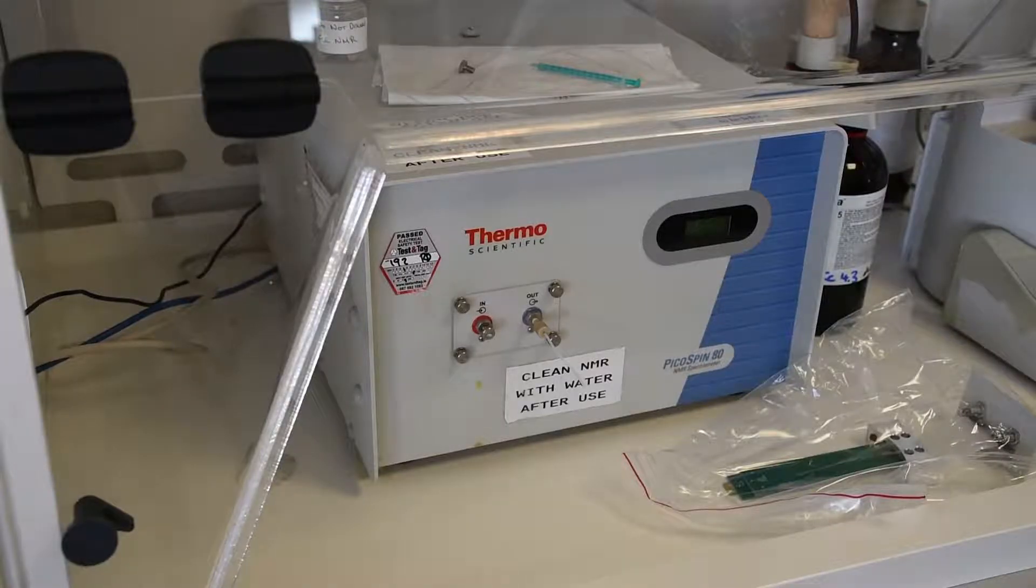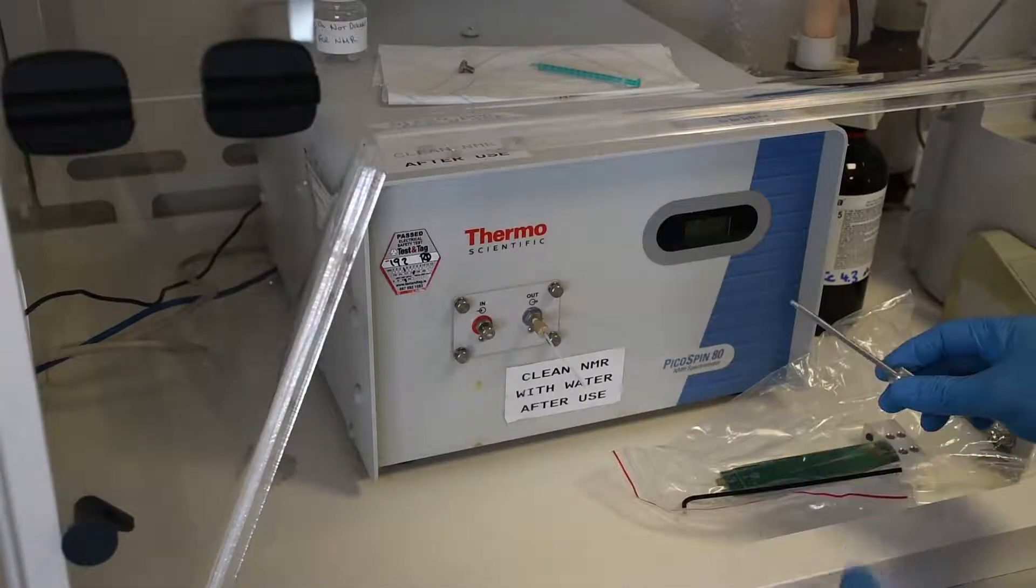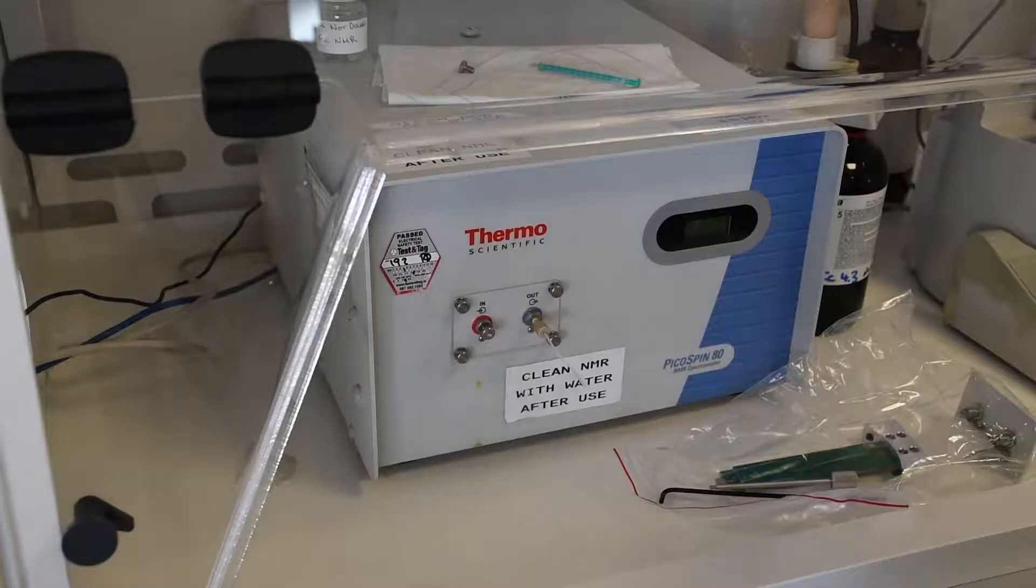It comes with a long allen key and a custom tool which is basically a screw that fits into a slot and allows you to pull the old cartridge back out. So here are those two tools, the custom tool and the long allen key.